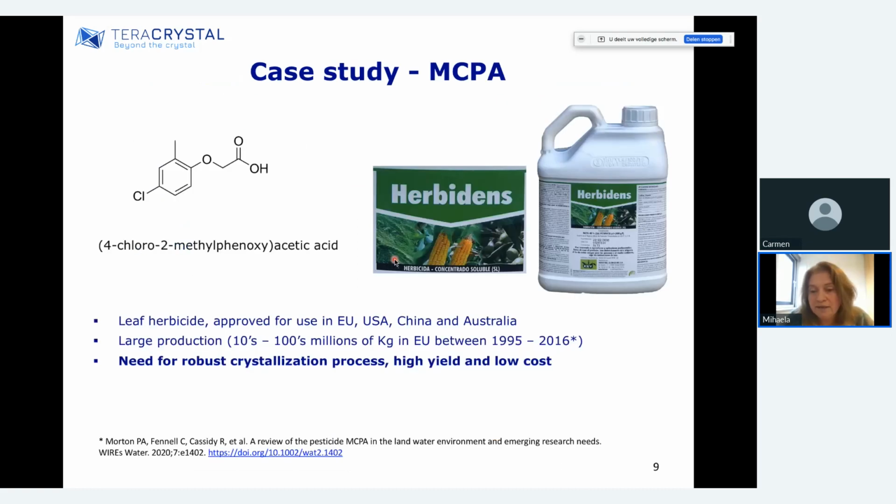And this brings me to the case studies, where I will share with you how we used Crystal16 basically to build certain screening strategies, but also to develop processes for crystallization. The first case study is about MCPA, which is a broad spectrum leaf herbicide, approved in EU, USA, China, and Australia, and produced in huge amounts. You see that it's a matter of hundreds of millions of kilos up to 2016. For these agrochemicals, because of production at such a large amount, the need for a crystallization process is continuous because of improvement of the yield, for instance, but also to decrease the costs.